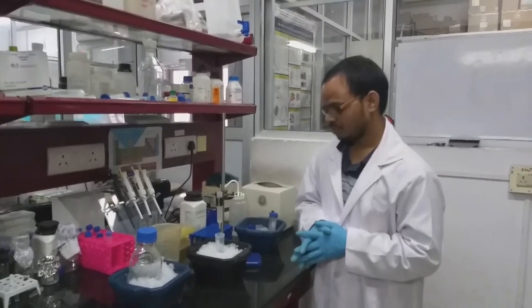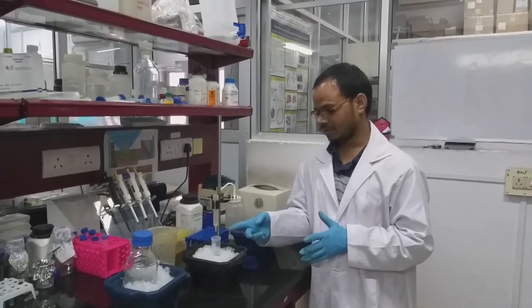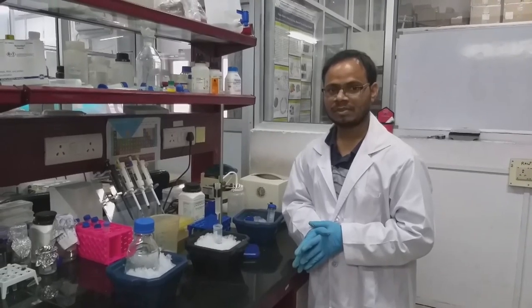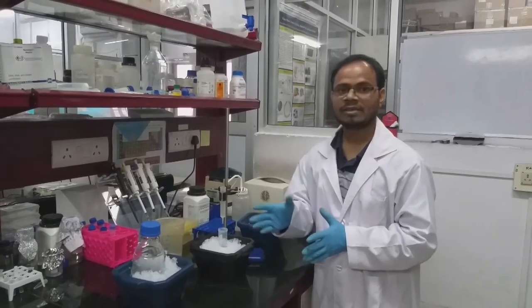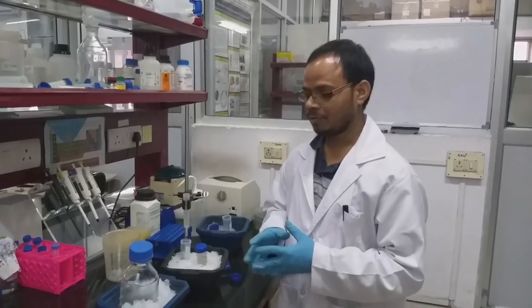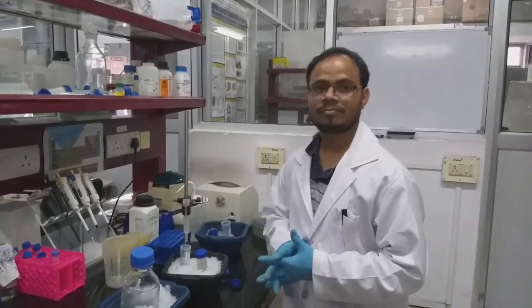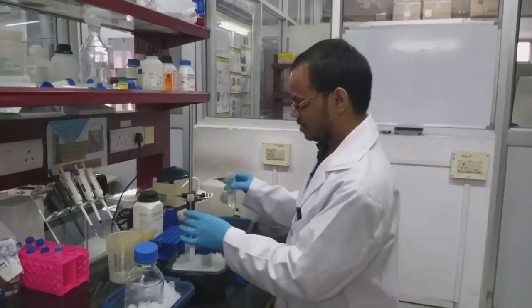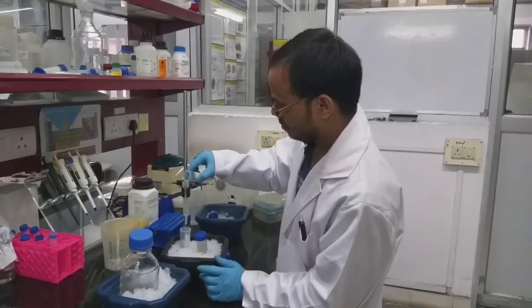So this is the flow through. Whatever we are getting is flow through. Next step, we will wash with the lysis buffer. In this step, we are going to wash with the lysis buffer or equilibration buffer. So this is the lysis buffer.